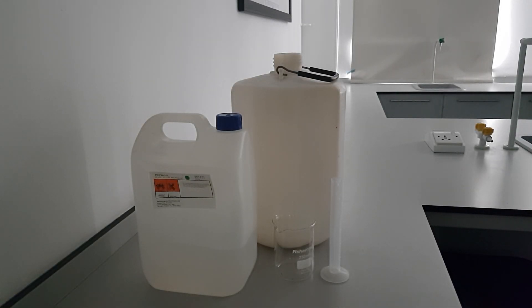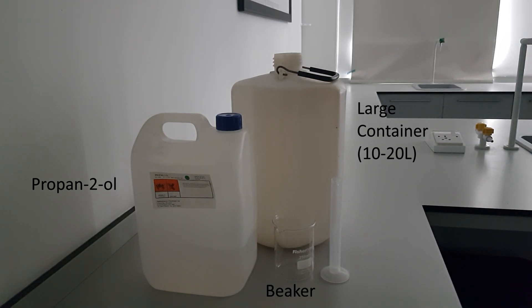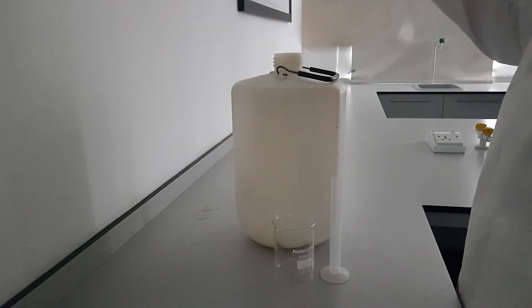What we need for this demonstration is some propan-2-ol, a large container (this one is about 10 liters), a medium-sized beaker, and a measuring cylinder. We start by measuring out a small amount of the propanol.